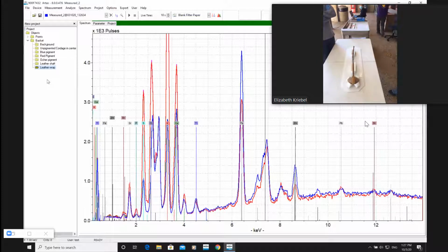Like a salt wash, chlorine is just going to be screaming. If there's methyl bromide, I would assume the bromine would be much higher because the elemental formula would require a ton more bromine. It's possible, I don't know how much methyl bromide you would use to preserve if it's a very light touch, but the difference between the chlorine and the bromine was night and day. This really was a lot of chlorine, so that's why I interpreted salt wash. But quantity would be my answer. But I'm not an authority. If anyone disagrees, definitely let the group know. I'm here to learn as well.